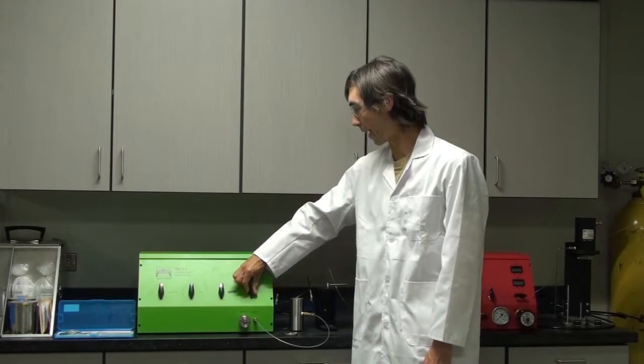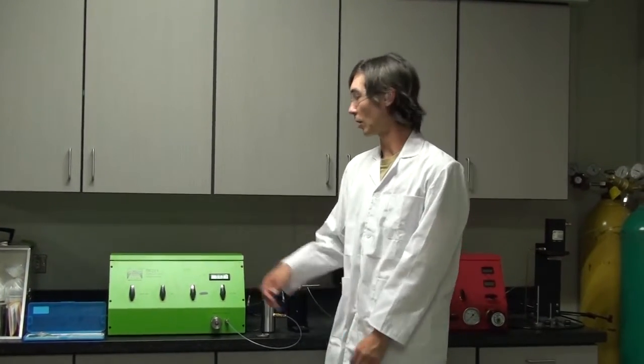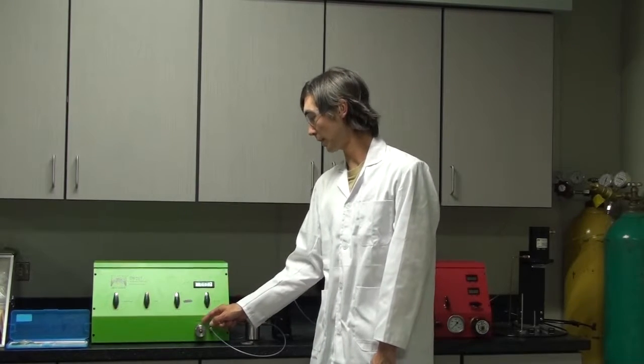By closing it like that, the apparatus is connected to a helium gas supply and it is set at 100 psi. Now slowly adjust the gas regulator knob until it reads 92 or 95 psi on the back of the apparatus. Now adjust the P1 knob such that digital readout should be the same as target pressure. This is the P1 knob.